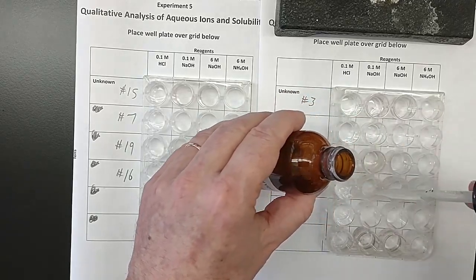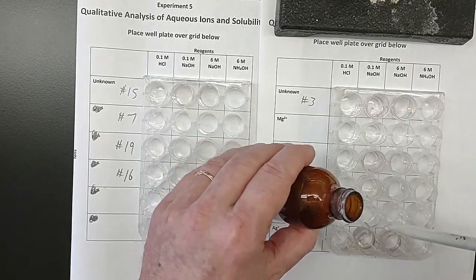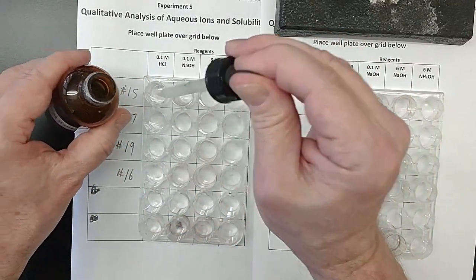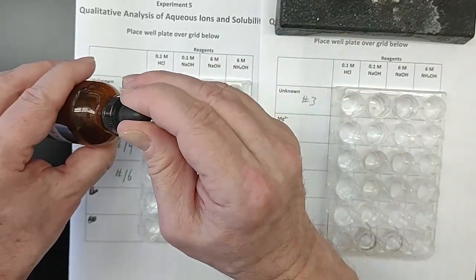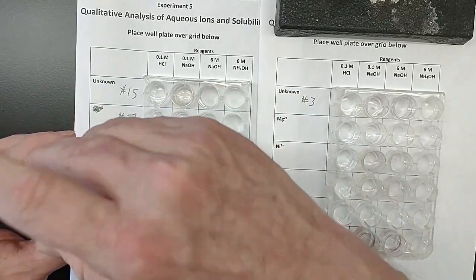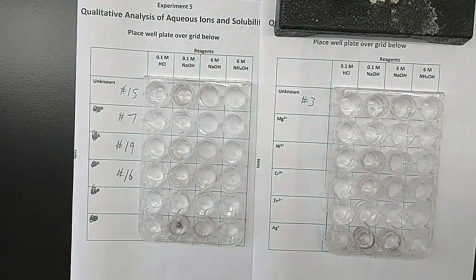Note that the hydrochloric acid, before I add anything to it, and the sodium hydroxide, before I add anything to it, are clear and colorless. I can see through it, and there is no color. So on my data sheet, that's what I'm going to record.